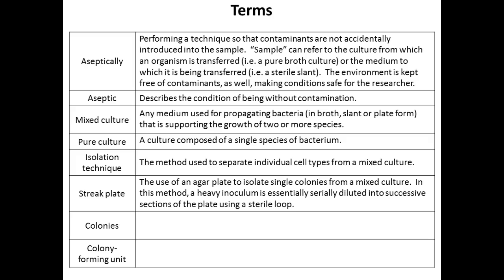We had some blood agar plates, but I forgot to refrigerate them. And you could see the differences based on that different type of food. And that's what the media is, right? It's food for the microorganisms. So on those solid culture media, they'll form these characteristic colonies, these growths that you'll see.